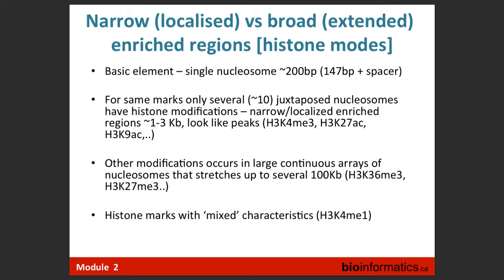This is one of the biases, yes. And this is a bad bias because it's not uniform. It is a location-specific bias, an unknown location-specific bias. This is not good. Another bias which I will be talking about is GC bias.